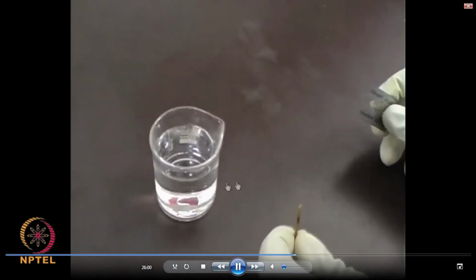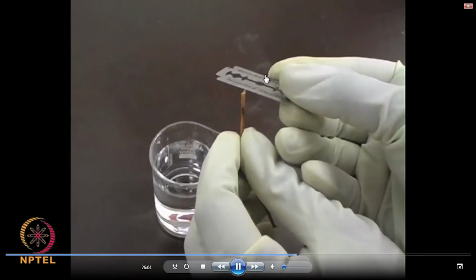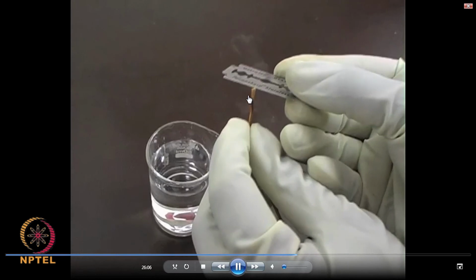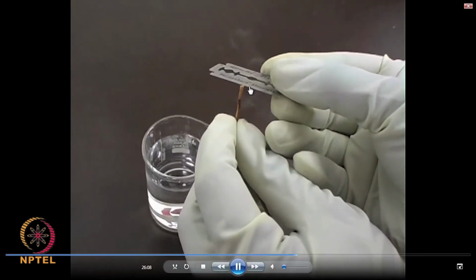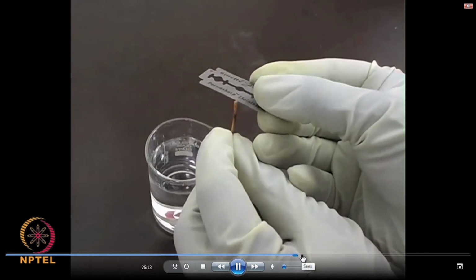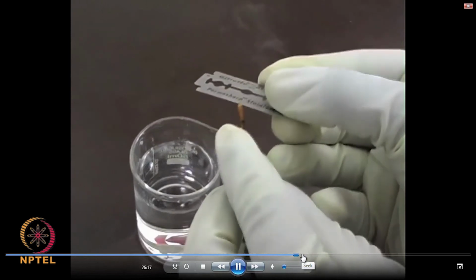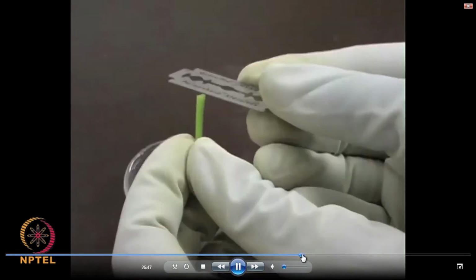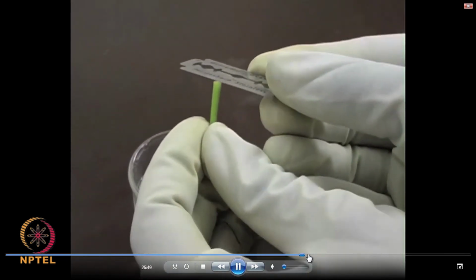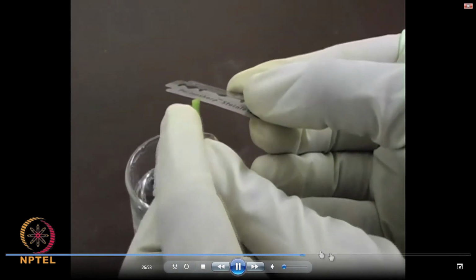You just take the stem and slice it with a razor blade to the smallest possible thickness, and then you put it in floating water in the beaker. Let me speed up this activity. This is done for the money plant stem now.